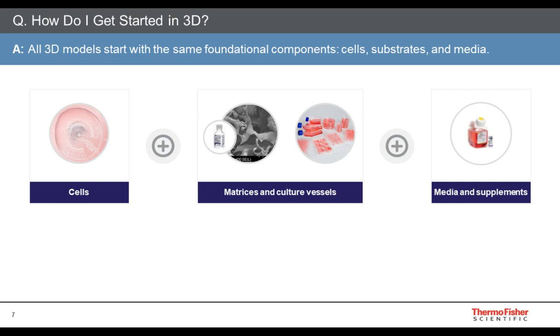Being able to label cells that are more than just the cells on the surface of the 3D model is not always a trivial undertaking, especially if you're working with antibodies. If you're working with different types of chemical probes for fluorescent labeling, I think those are a little more manageable right now based on existing protocols, and may only need some more minor tweaks. So that's the food for thought that I'd like to leave everyone with, and hopefully some of that spurs some questions that you can submit to us.